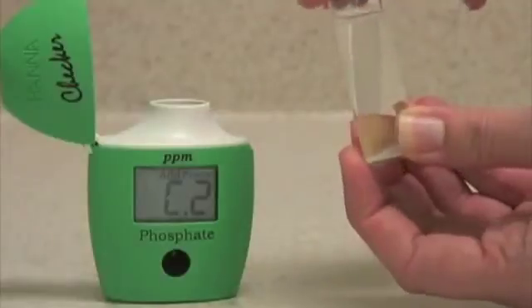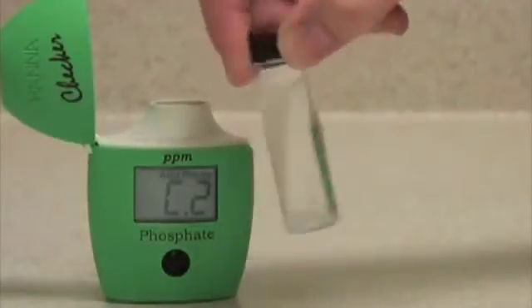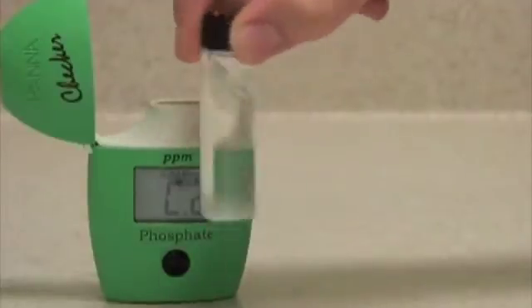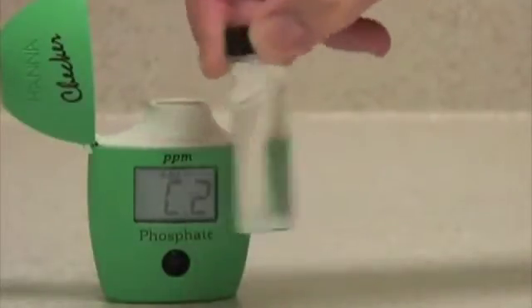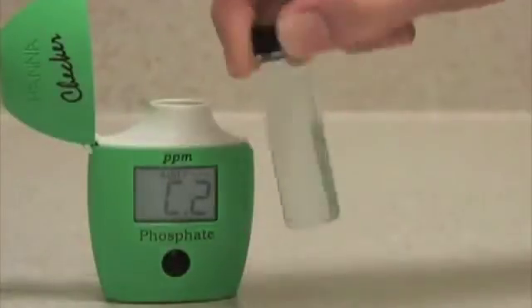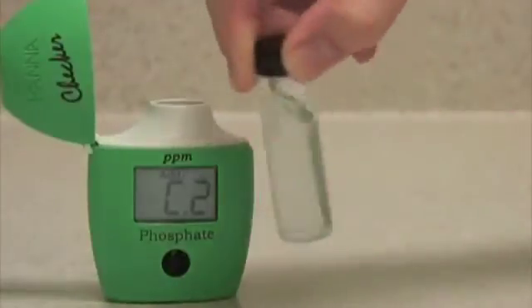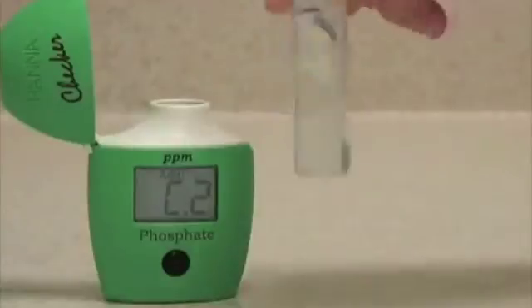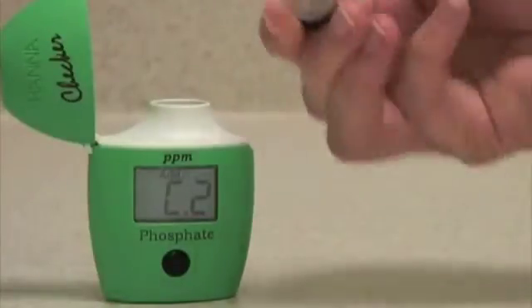Put the cap back on and shake gently to dissolve the sample. Try to avoid shaking it too vigorously, as shaking it too much can introduce micro bubbles that will alter your reading as well. The best way to do this is to swirl the vial gently like this, or invert it like this, until the sample is mostly dissolved.